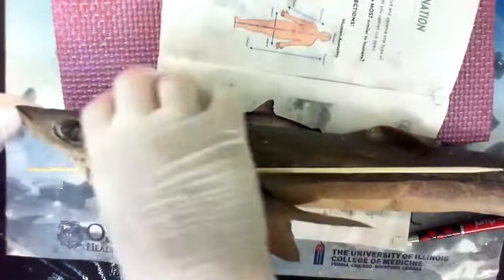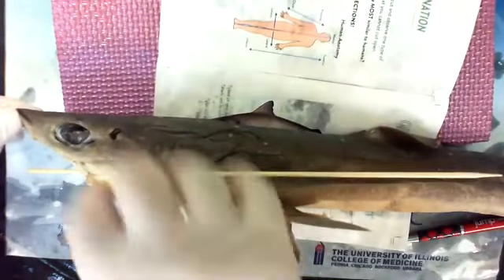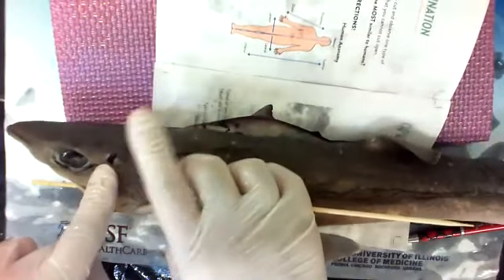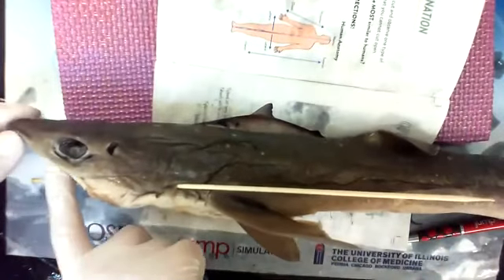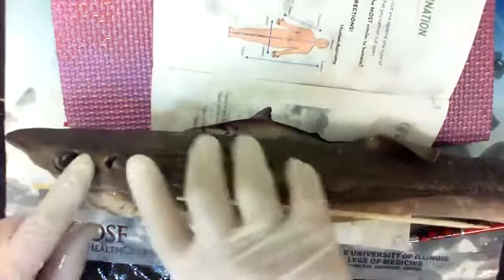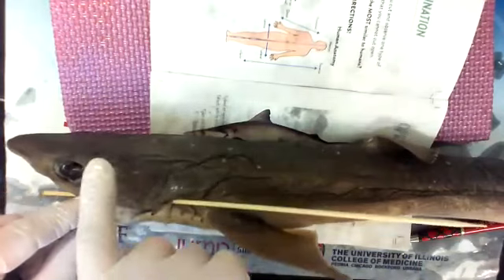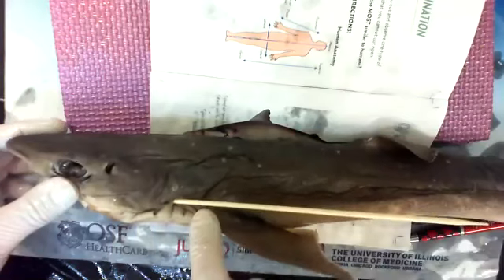So sharks are constantly swimming so they can get that water flowing either into the spiracle and down or into the mouth, and some sharks have the spiracle, which is on the checklist, for breathing. Great white sharks don't have this. So a great white shark has to swim all the time or they die. They always have to have water going in, going over the gills, grabbing oxygen, and then going out. Sharks with a spiracle can actually suck water in here, puff their cheeks up, squeeze their cheeks, and blow it out their gill. That would be like you putting food into your mouth, sucking it in, holding your chest tight, and then blowing out your nose.